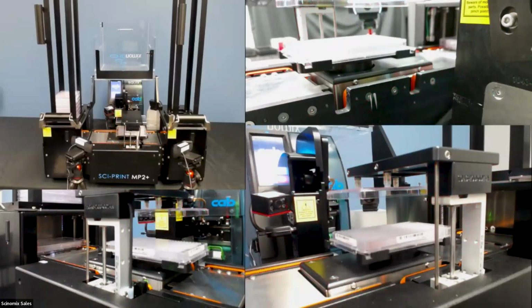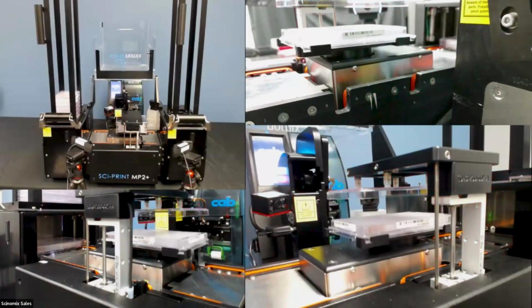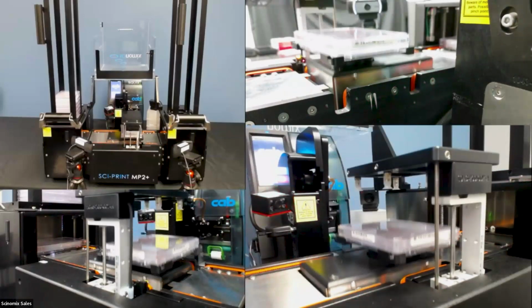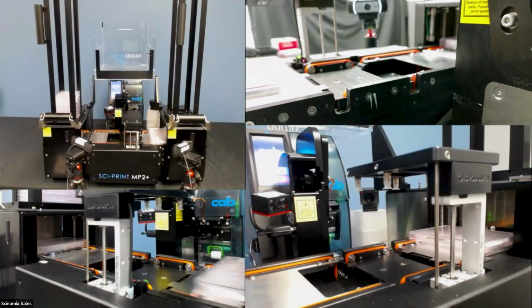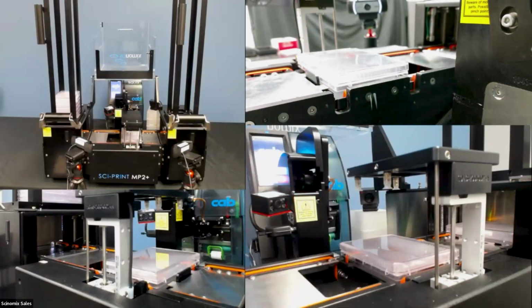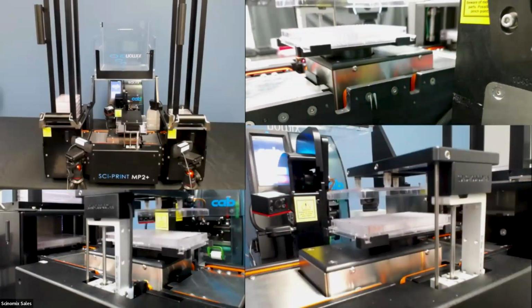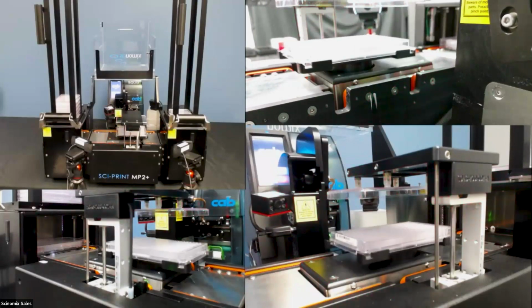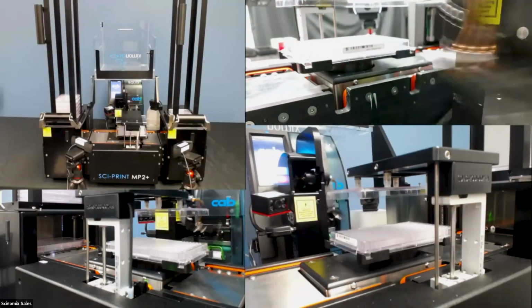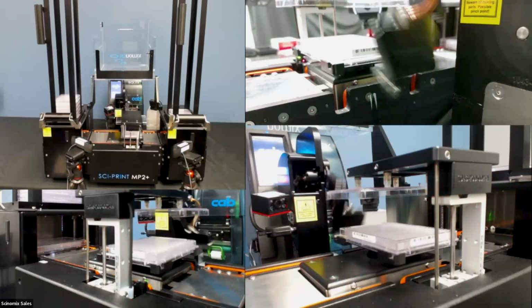The red light is the barcode verification. All sides are labeled and delidded, and we'll go to the up stack. And then during this time, the nice part about this is the first plate will go by itself, so it might take a little bit longer for total. But as you move through a stack of plates, each position is moving concurrently at that point. So while it is tamping, it is unstacking, and it is restacking on the other side.